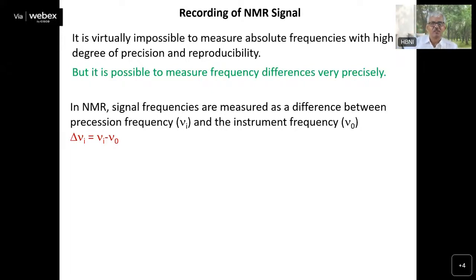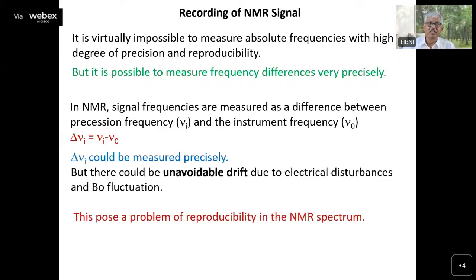Clear? That's why the concept of the rotating frame is very useful. So delta nu I can be measured precisely. There is no doubt about that.